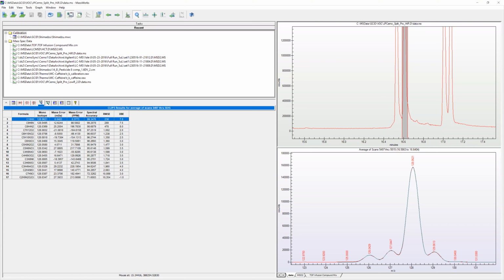So if you have what's purportedly a standard, typically considered a pure standard, or a 98% or 95% standard that you purchase from Sigma Aldrich, for example, and you run them through either your LC or GC system. If you have chromatographic separation and there are two additional isomers blended into the standard, those three total compounds may be chromatographically separated or maybe not.